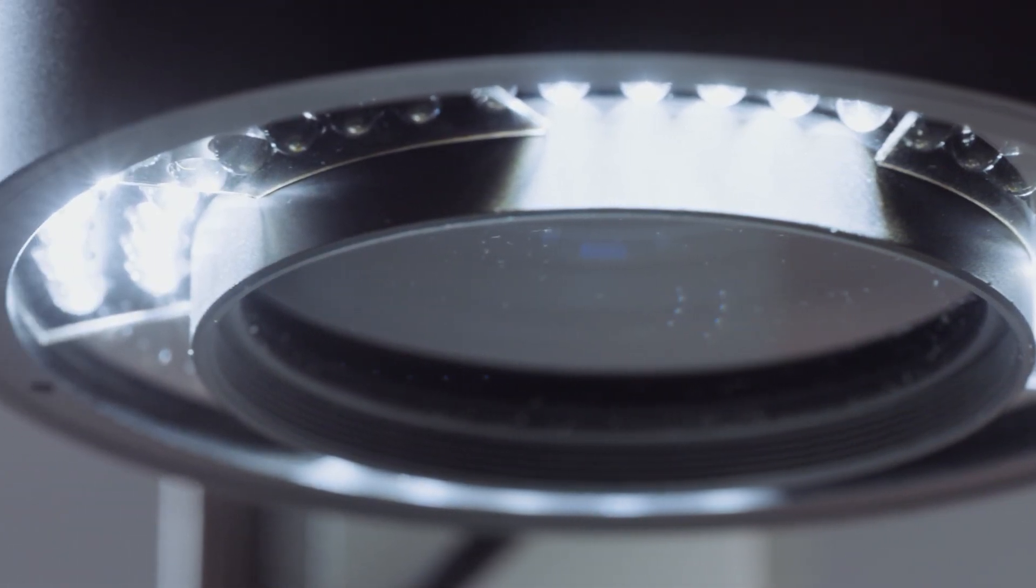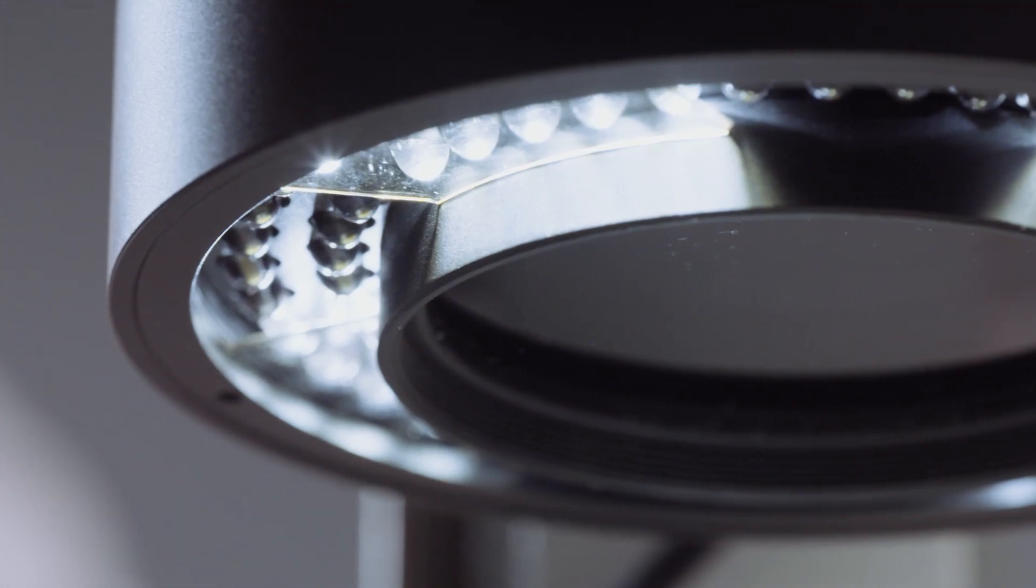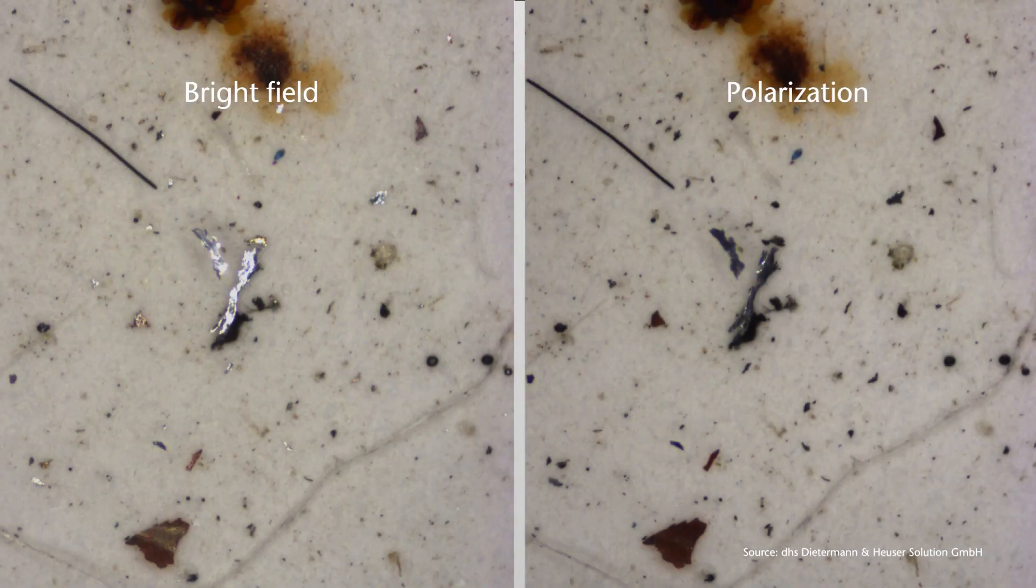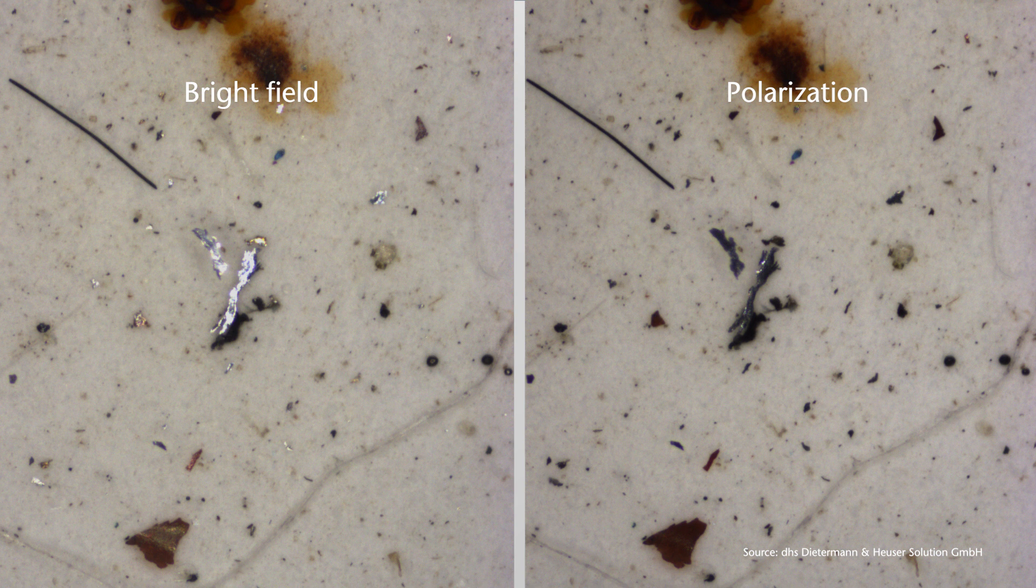A typical field of application here, for example, is the field of residual dirt analysis, where an image in Bright Field as well as in Polarization is needed in order to analyze the filters.